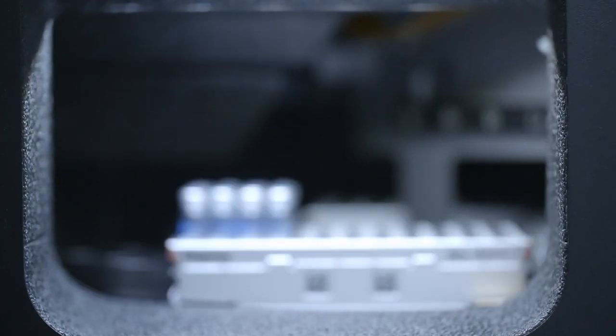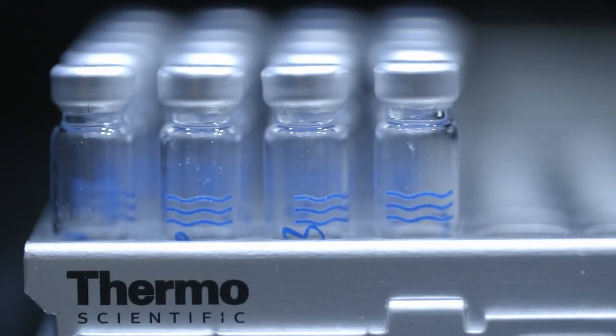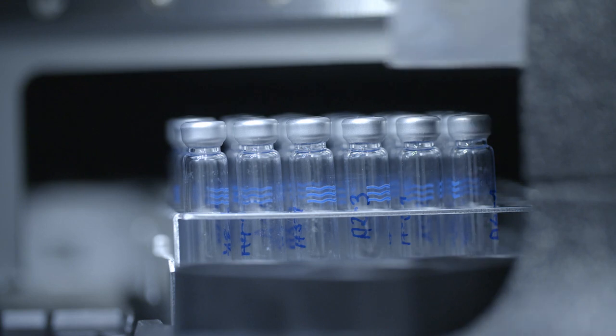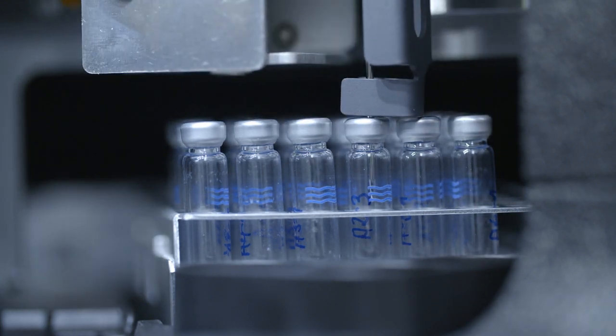My favorite feature is the sample pre-compression, because I realized that the sample pre-compression is the major contributor to retention time precision. This is very important, especially in QC departments where you just compare retention times. This intelligent sample pre-compression brings the content of the sample loop up to system pressure before switching the injection valve, and this virtually eliminates any mechanical pressure shock and pressure stress on the packed bed of the UHPLC column.